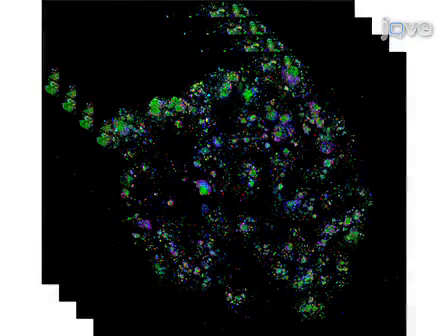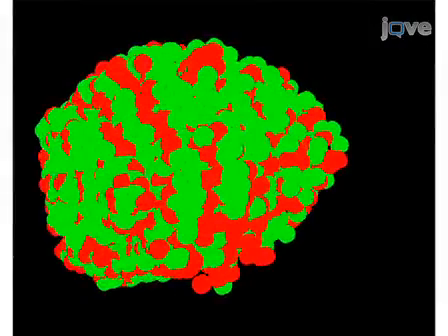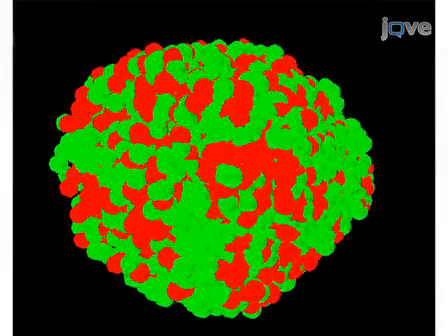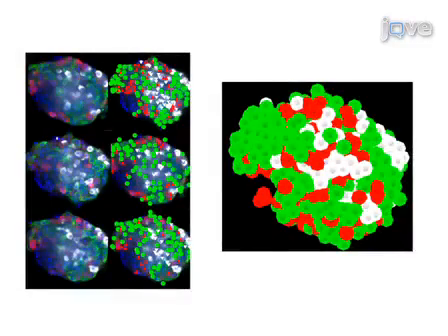Next, a 3D reconstruction of the virtual slices is performed using ImageJ. The final step of the procedure is to capture a stack of individual islet images using the Slidebook software and to map the image stacks manually in 3 dimensions using Stereo Investigator. Ultimately, precise islet architecture with 3D coordinates for each islet cell can be obtained through a combined method of 3D imaging and manual mapping.